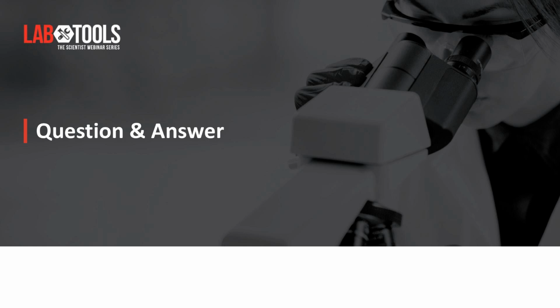Thank you very much. We have a question asking whether you can explain why, for certain sequences, the percentage of perfect clones is smaller when you use longer adapters. This is a tough one, actually, because I'm not sure it's statistically relevant. I would conclude this if I had done it a lot of times. We are doing this, but not in a way that could strictly rule out that the rate of integration is always lower with the longer adapter compared to the shorter adapter.